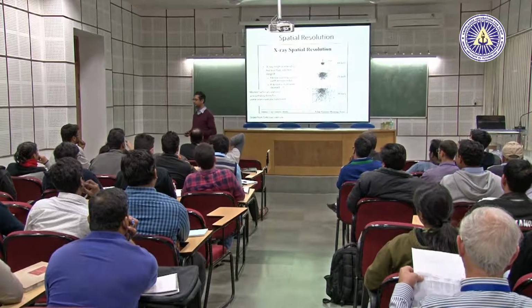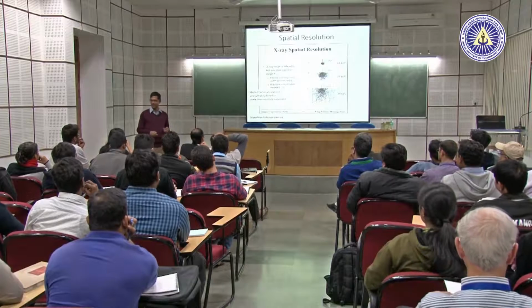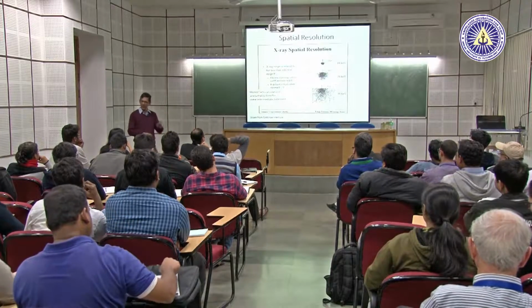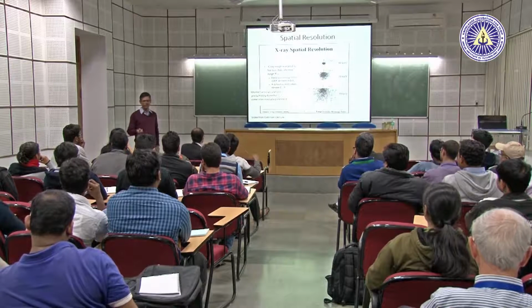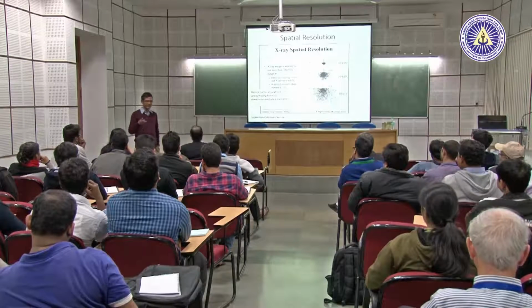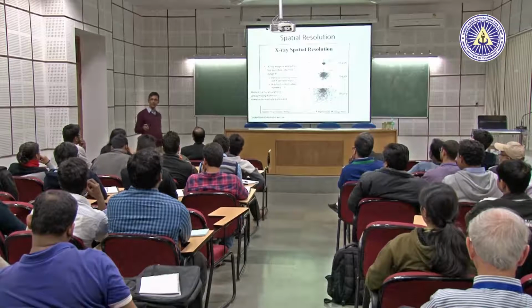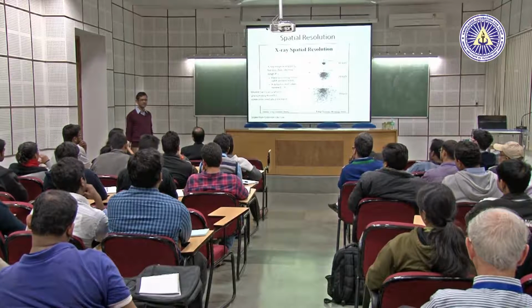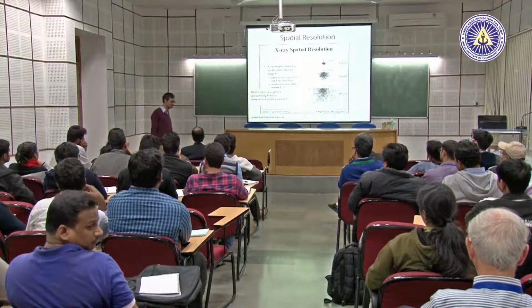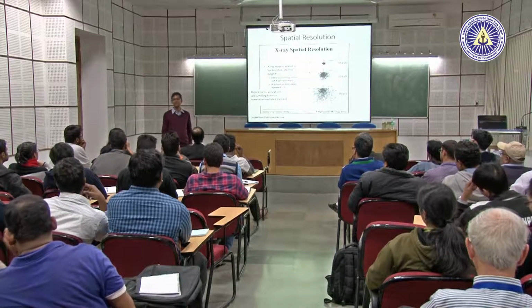So can we rely on the data? No. You have to go to WDS to rely on that data. Carbon is extremely difficult in any machine because carbon is present in all samples, so whether it's coming from the sample or spurious is very difficult. Oxygen is okay, still better. Oxygen, nitrogen, you can do that. Even in EPMA they struggle. Yeah, carbon percentage is not reliable, because you don't know how pure your sample is, right?